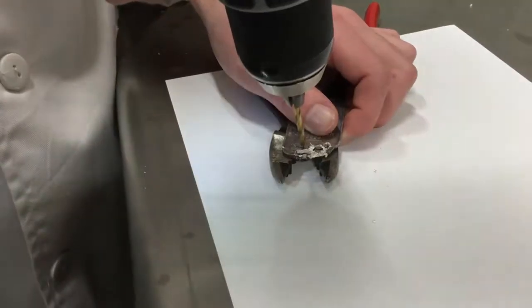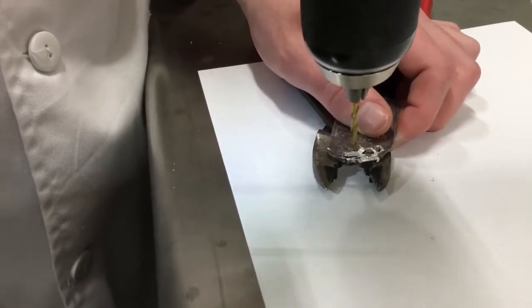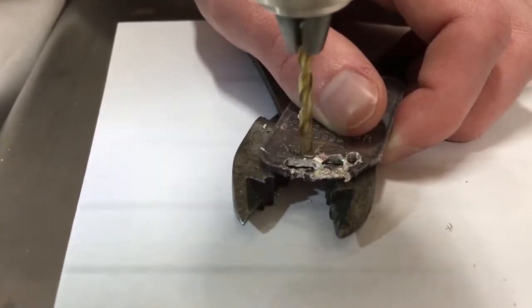Hello, today I will be making silver nitrate from a bar of pure silver. Doing this requires silver to be dissolved in and reacted with nitric acid. This process is sped up if the silver is in a fine dust or shavings.